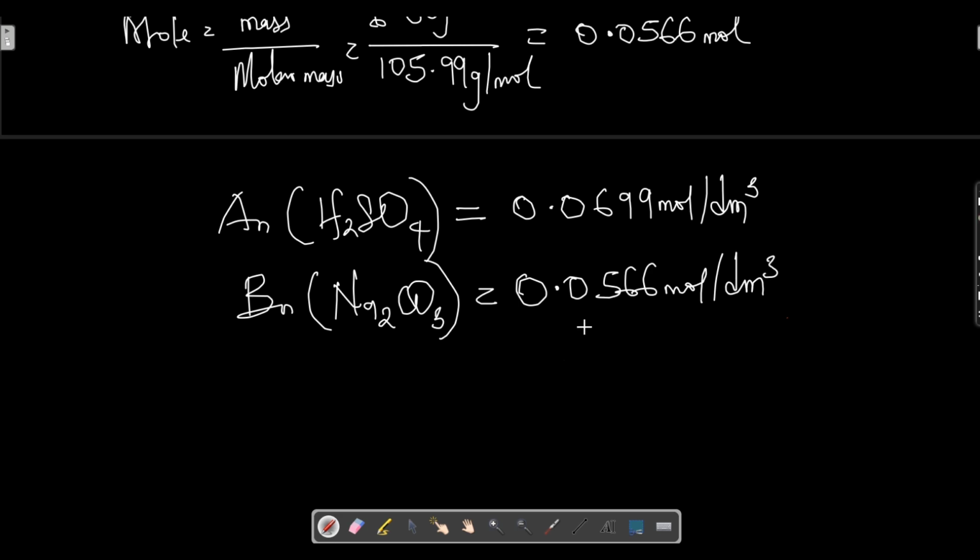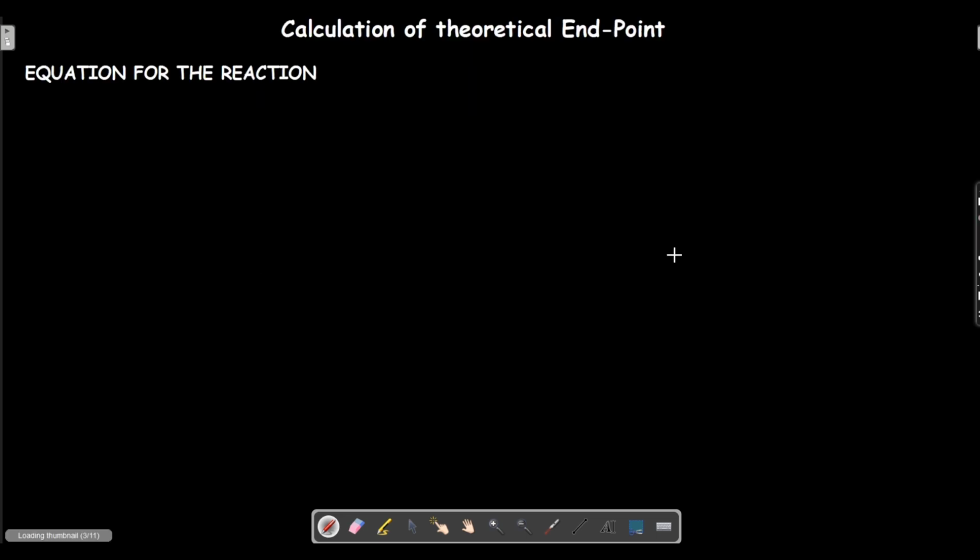So now we'll go over to calculate the theoretical endpoint of this titration.